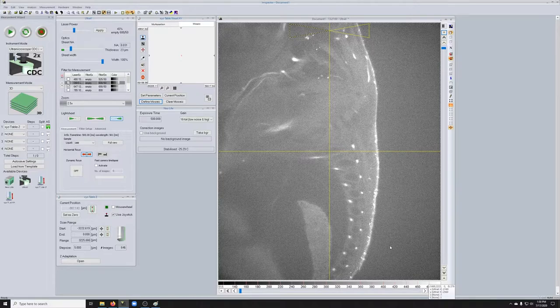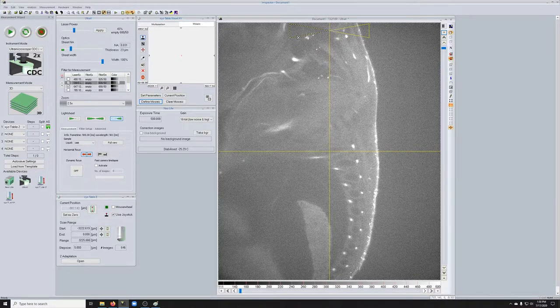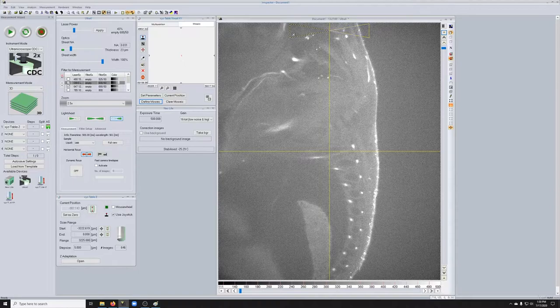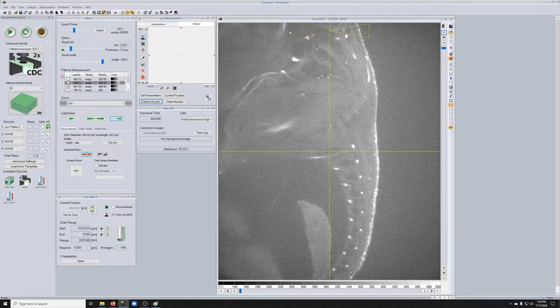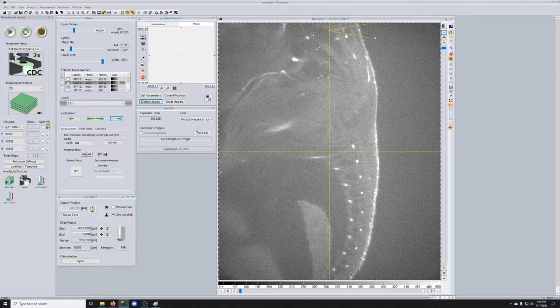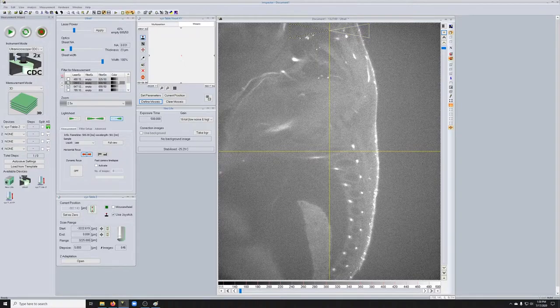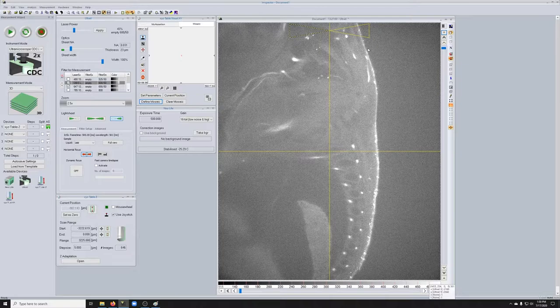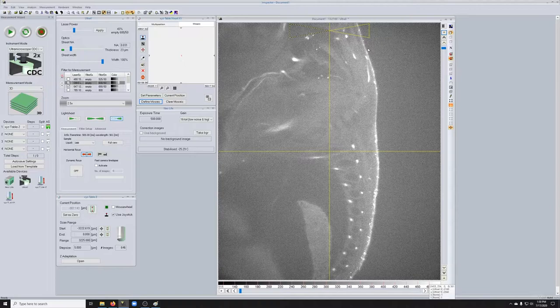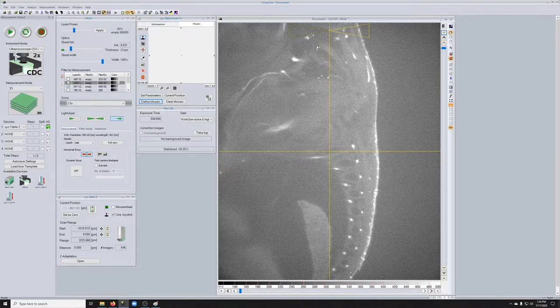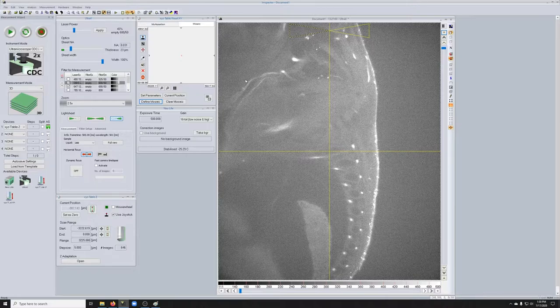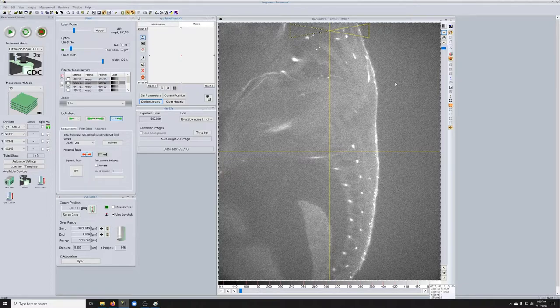One rule of thumb is to use something that in terms of the width is not wider than the width here shown by this bow tie that represents how much the light sheet is changing in the z dimension. Because from here to here, the width of the light sheet in z changes by about 40%. And that's usually okay for doing stitching. But if you have a cropped region that extends beyond that, the quality may not be sufficient for what you need.